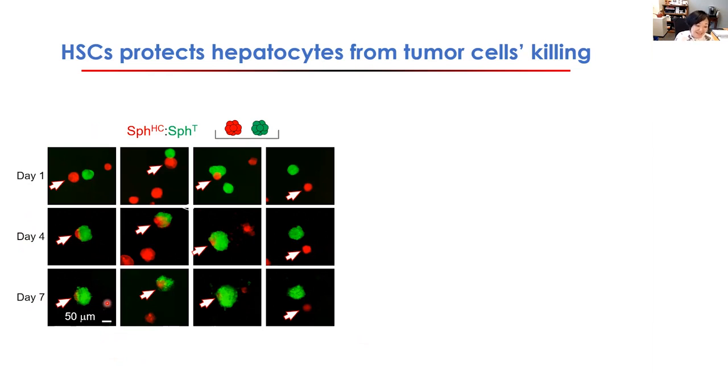So you can see they literally swallow this red hepatocyte organoid, these spheroids. In different areas, you would see the disappearance of the red fluorescence and the expansion of the green fluorescence. But even those hepatocytes that are not in direct contact with tumor spheroids gradually diminish as well. So they're just not able to handle tumor cells being around.